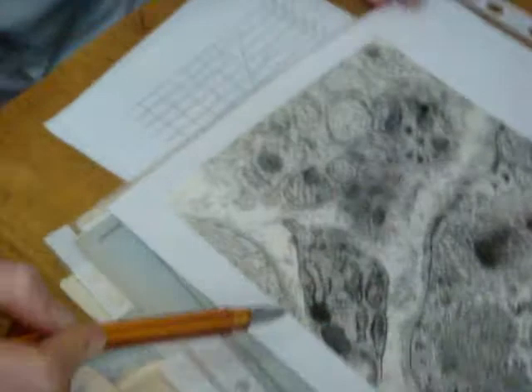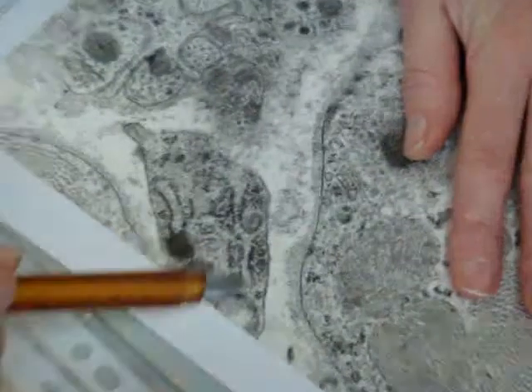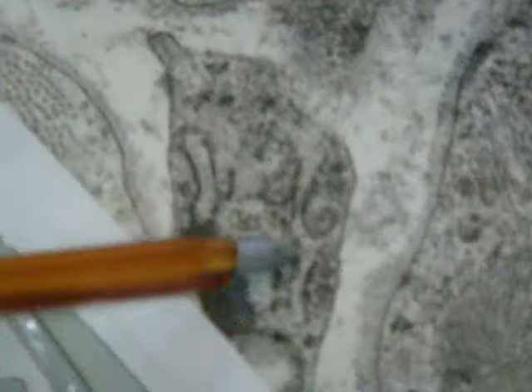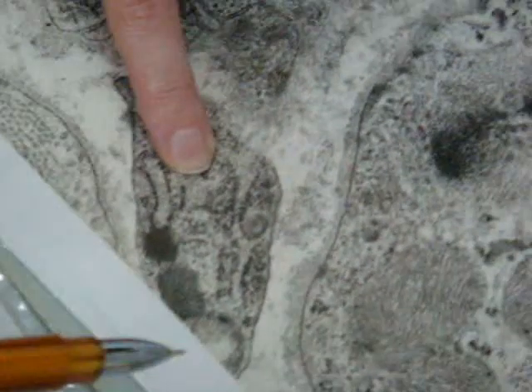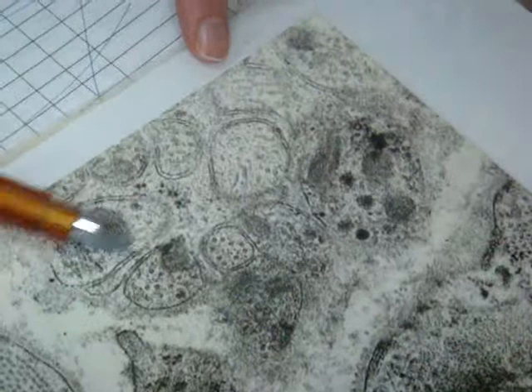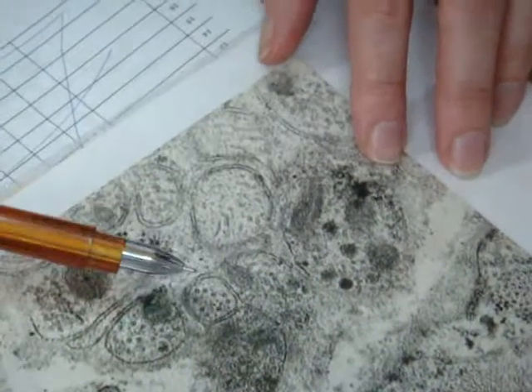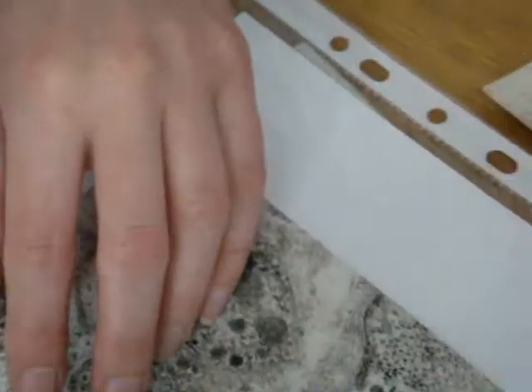Let's look here. I think this is also cardiac muscle. Let's look at this. We can't see any basement membrane, so this part of the cell belongs to connective tissue. We can see rough endoplasmic reticulum. This is a fibroblast. Let's look at this. We can see an axon inside the cytoplasm of a Schwann cell. This is an unmyelinated nerve fiber that is going to innervate.